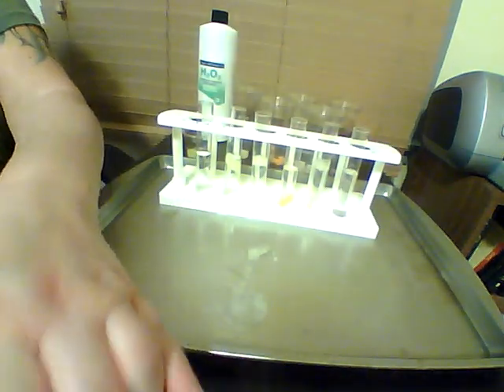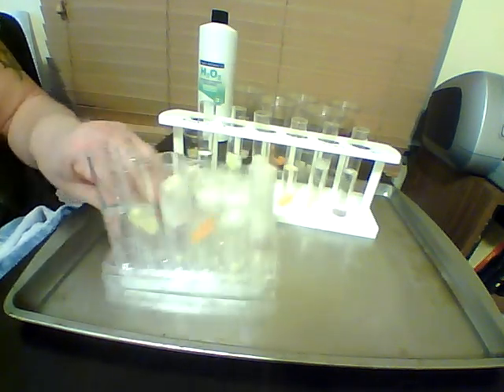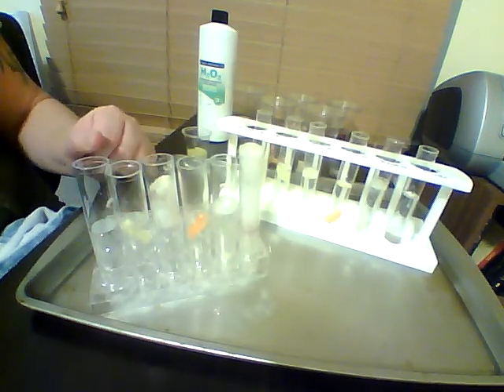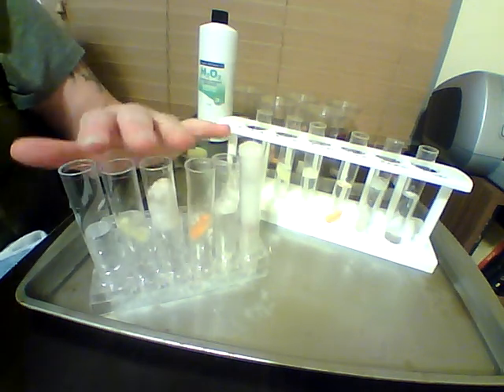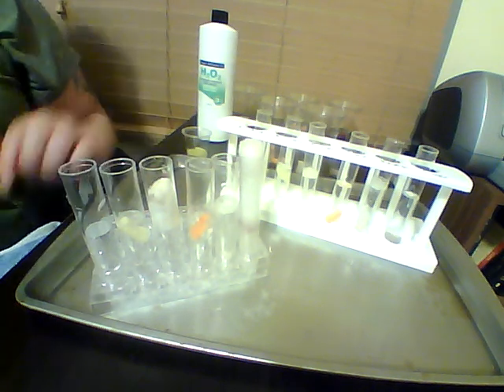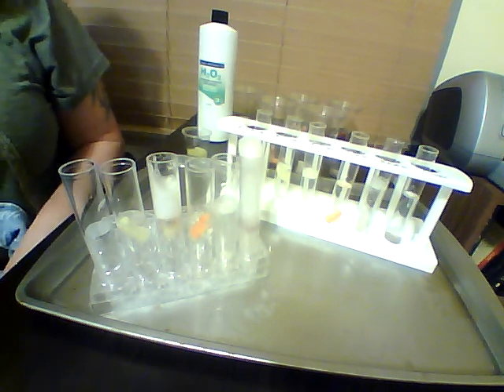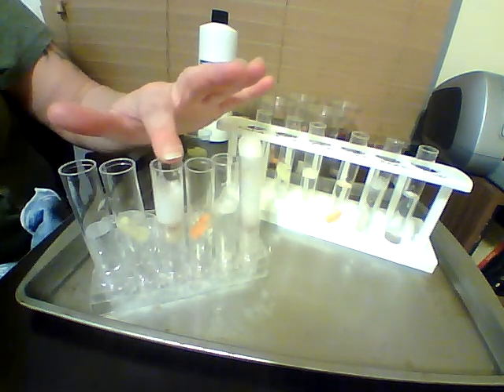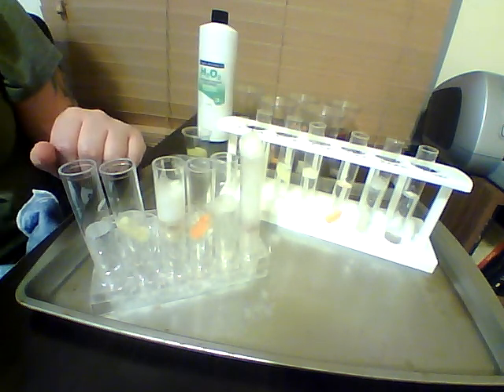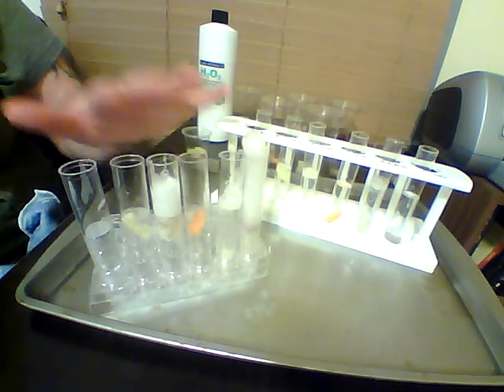Okay, so again, we have our cooked samples here and our raw samples here. And you can see that in our raw samples, we got a much more dramatic reaction, and some things had more dramatic reaction than others, right? Our banana was particularly good, our liver is great, and our potato is pretty good too. Carrots and pineapples maybe don't have as much catalase in them.